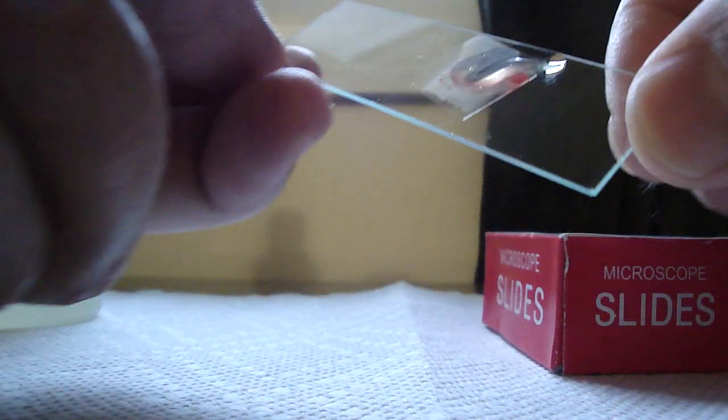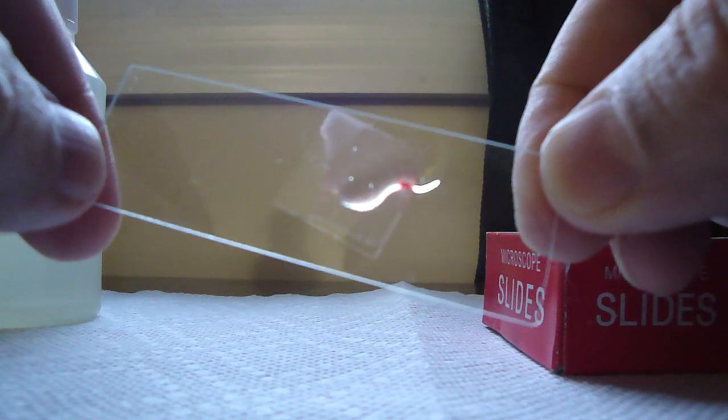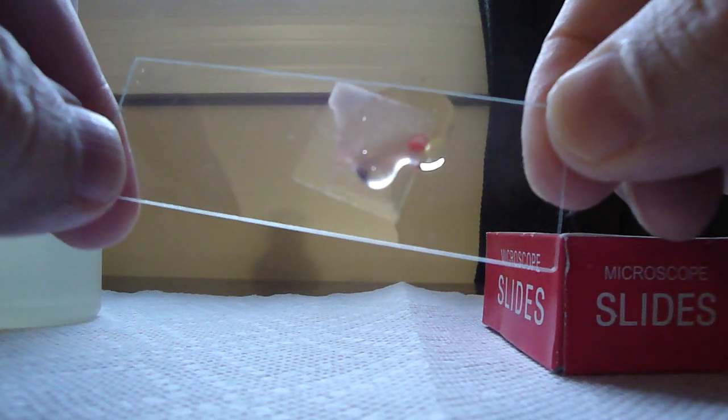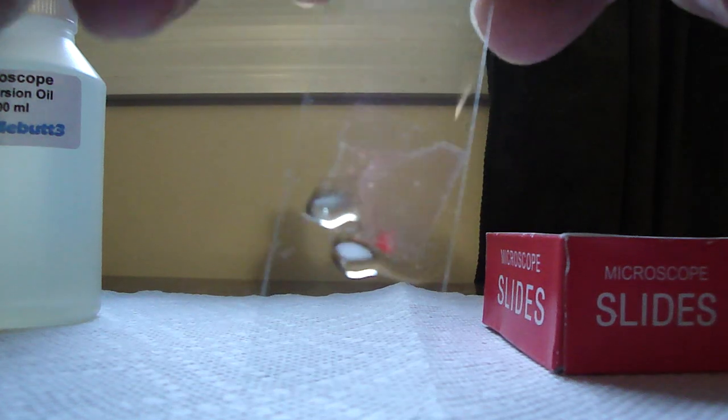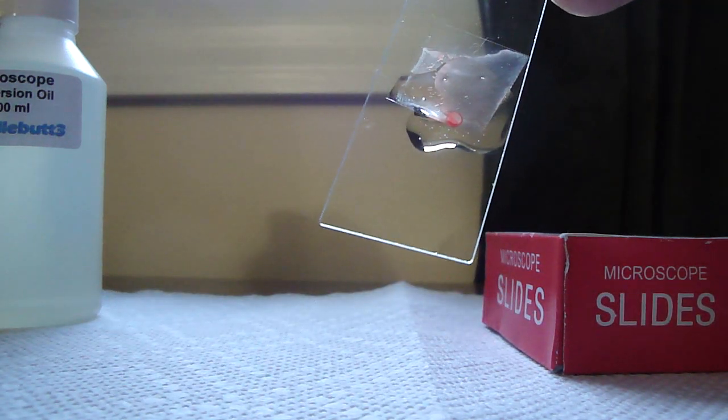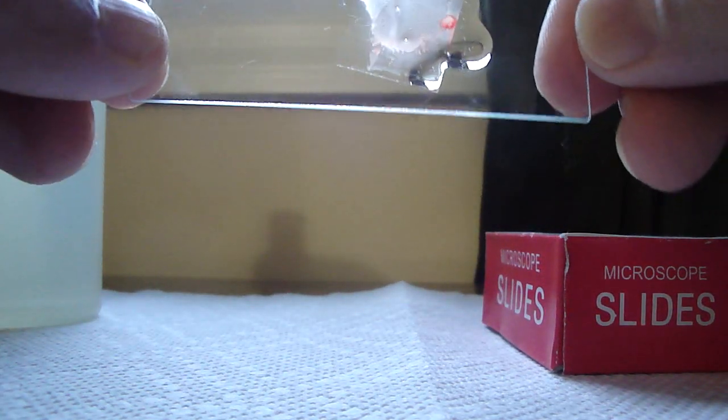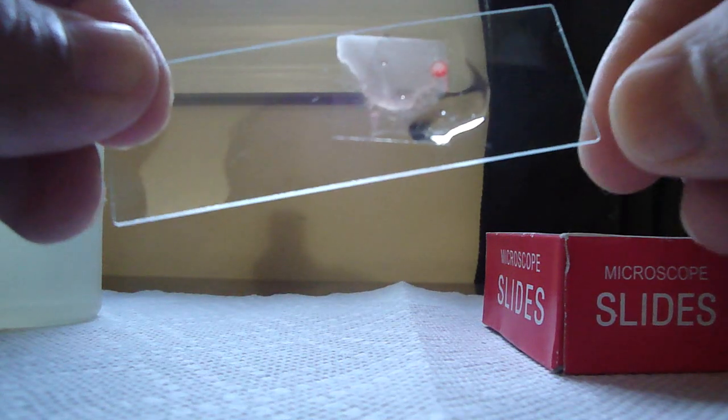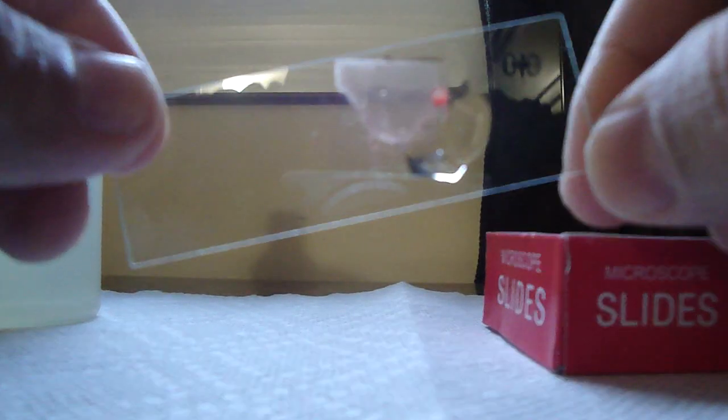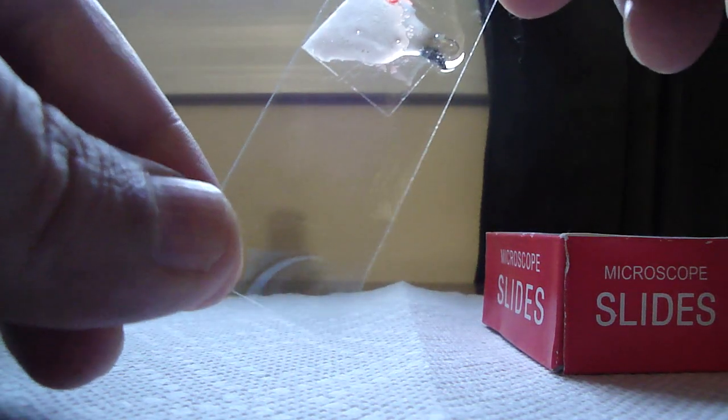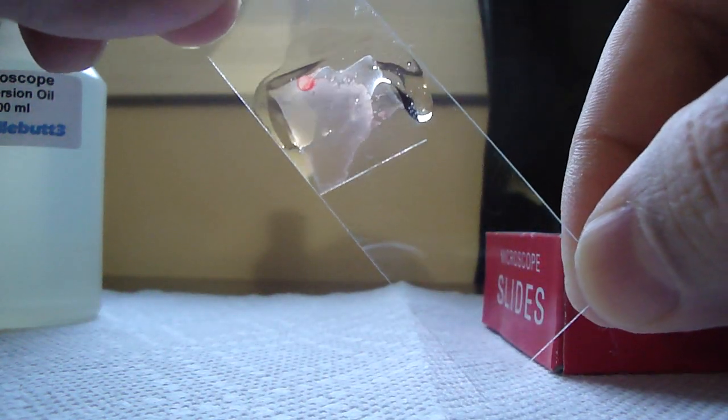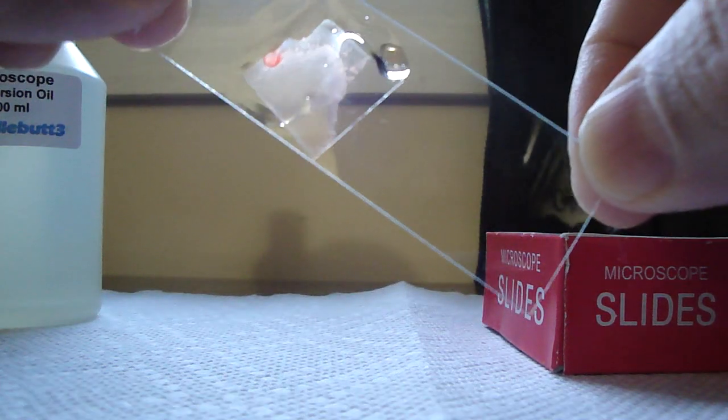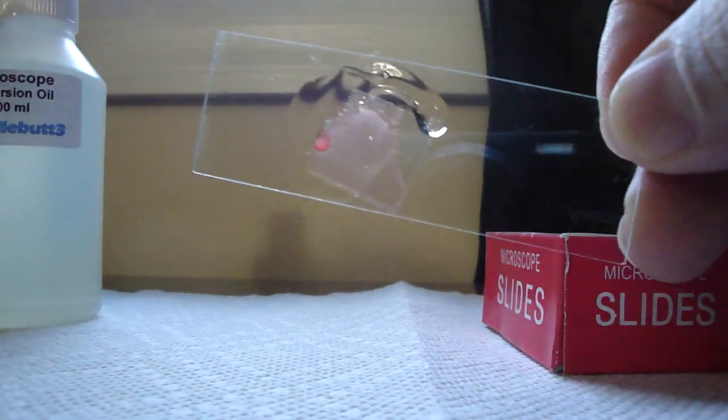And it prevented dehydration of the blood plasma and allowed the cells to be more viable for longer periods of time. So I was able to make observations for longer periods of time. And little by little, I'm watching all these things coming out of the red blood cells. And time and again, with various people who have been bit, if I use the same method, slowly but surely you see these spirochetes burrowing out of red blood cells. And it's amazing to see the various types, the various morphologies. I've seen the L-form. I've seen the beads of string.